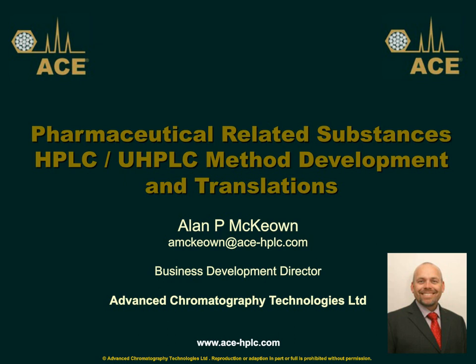I think the restrictions are quite tight. But for everybody still listening, I absolutely recommend that you check with whatever pharmacopoeia you want to test to, whether it's the USP, the JP, the CP, the PharmUA, the BP, whatever it is, and check the chromatography general chapter in that particular publication. But I'm pretty sure for gradient separation there isn't much flexibility. My understanding, from talking to the people on the committee who make these changes, is that there are discussions about how we can use modern technology and modern particle platforms for gradient analysis and monographs as well, but it's not quite there yet.